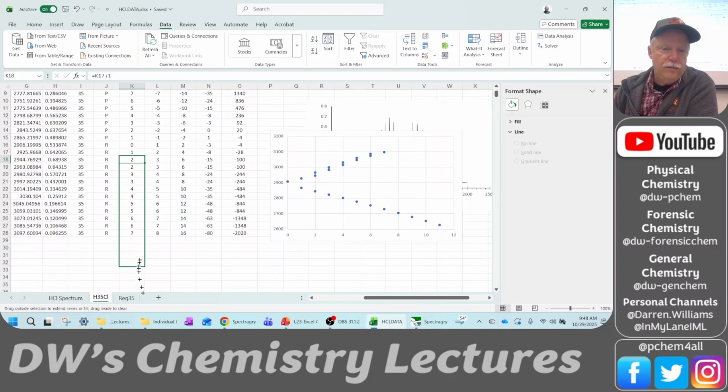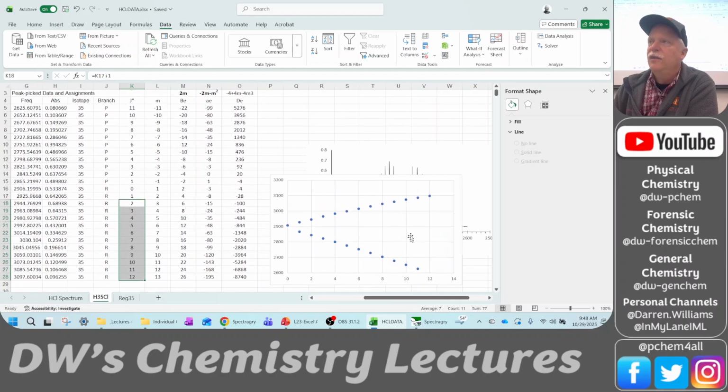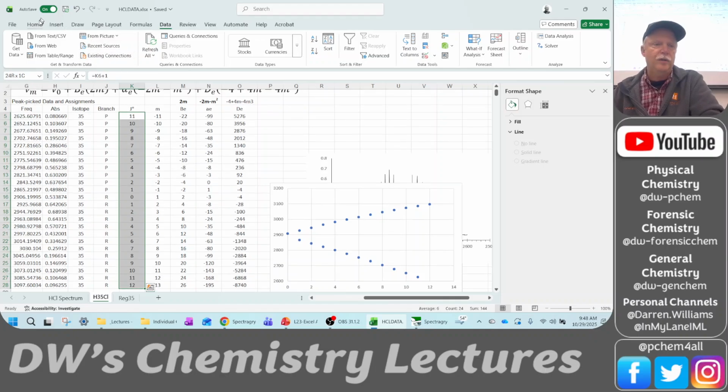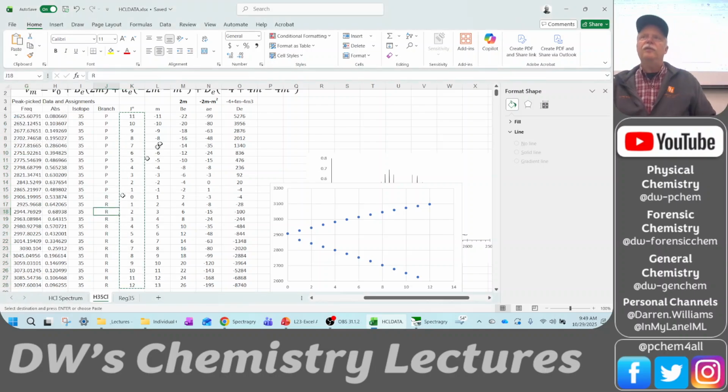And that'll go all the way down. Okay, got it. So see, now our plot looks very nice, and that's what we should expect. If you want to get rid of those formulas, you select the whole column where those formulas are, and then you just quickly copy and paste values, and now you just have values and no formulas. Okay. So let's redo the regression.